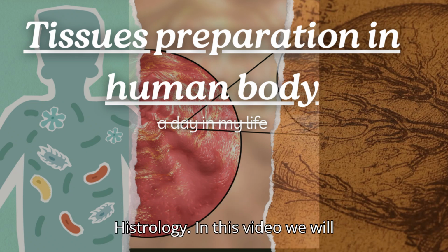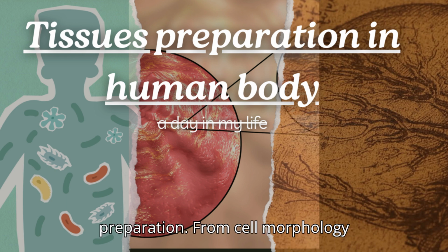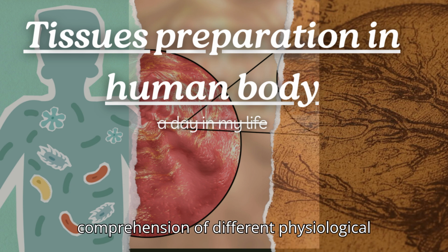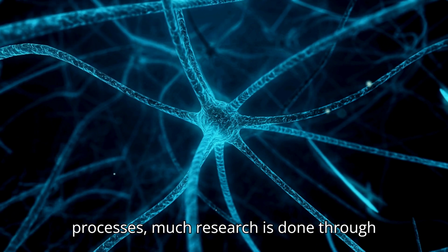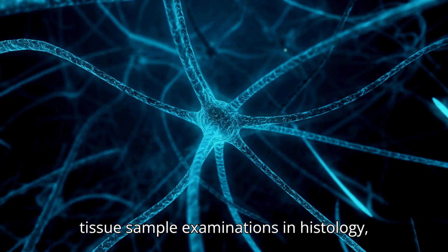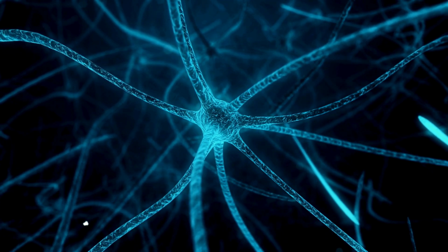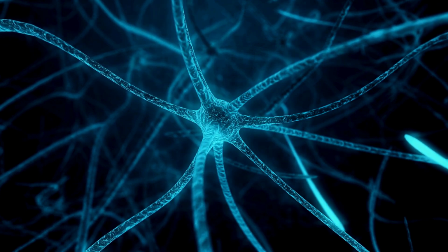In this video we will discuss human body tissue fixation and preparation. From cell morphology to the diagnosis of various diseases and comprehension of different physiological processes, much research is done through tissue sample examinations in histology, pathology, and biomedical research. An integral part of these fields is tissue preparation and fixation.